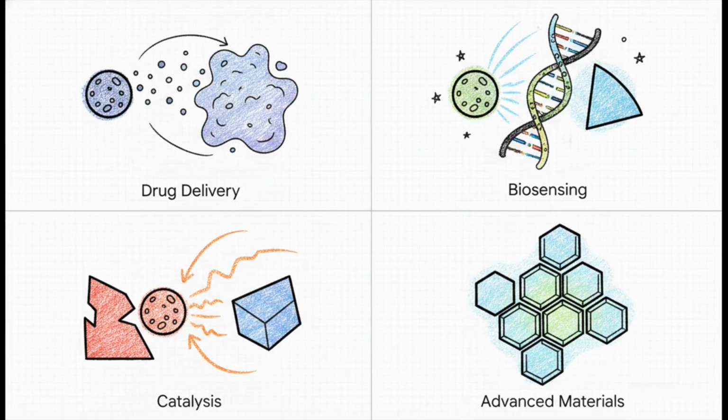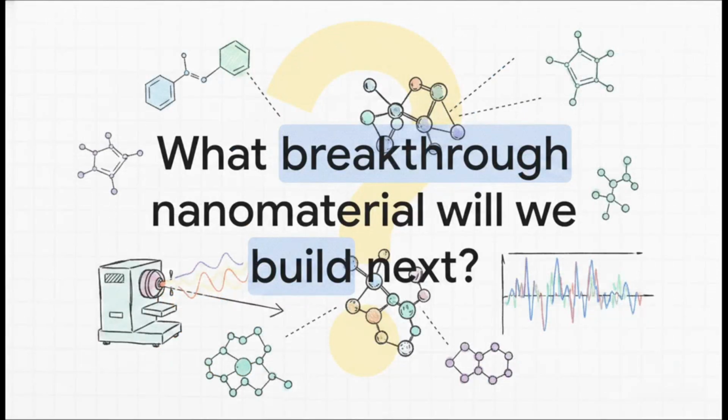Literally none of these life-changing advancements can confidently move forward without FTIR there to verify the surface chemistry every single step of the way. We really do have a window into the invisible now. We have this amazing tool that translates the physical vibrations of molecular bonds into a clear visual language. It lets us build the future, molecule by molecule.